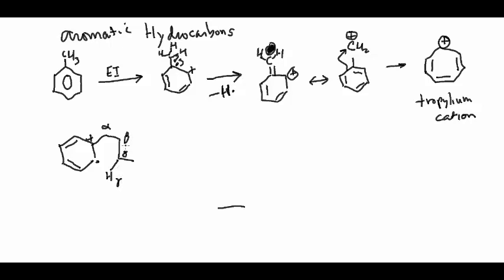Now the designation of the atoms as alpha, beta, gamma can be a little confusing, and I think it's kind of ambiguous the way that they tag them, but that's another matter. We can talk about that later. And this is a McLafferty rearrangement fragmentation. It's a fragmentation that involves a transfer of a hydrogen from one part of a molecule to another.